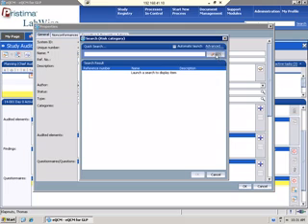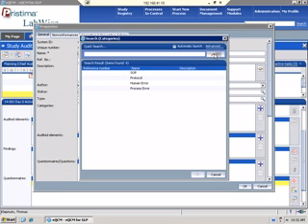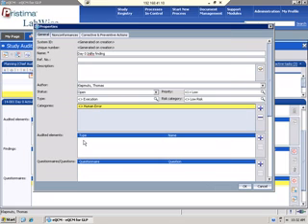And you can also define risk categories, low risk, medium risk, high risk, whatever type of categorization you'd like to put in the system. Again, there's also categories. Again, this metadata allows you to filter and generate reports on the types of findings you have within the system. And so this is human error, they made a mistake.